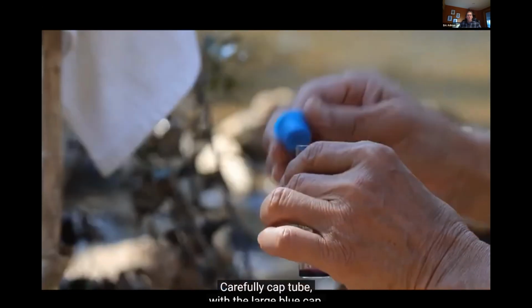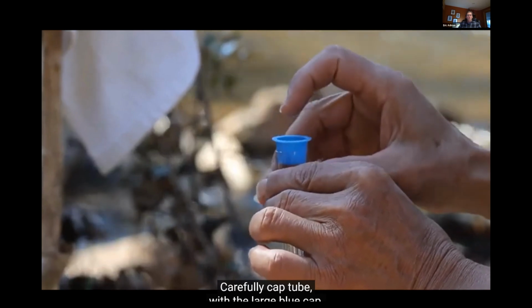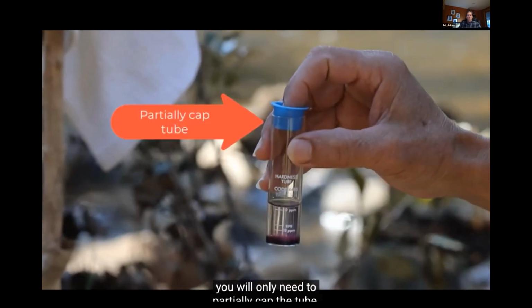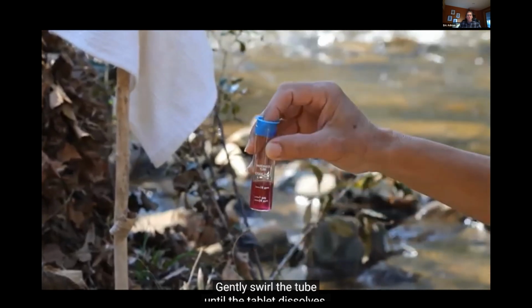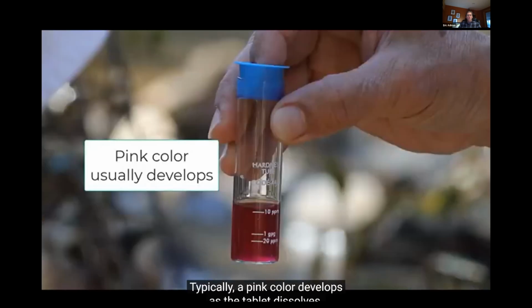Carefully cap the tube with the large blue cap. You will only need to partially cap the tube. Pressing the cap down completely on the tube could cause the glass tube to break. Gently swirl the tube until the tablet dissolves. Typically, a pink color develops as the tablet dissolves.